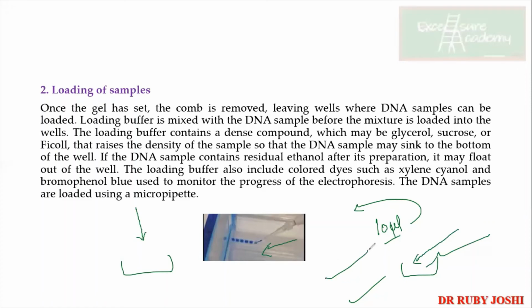So we get so used to it that literally we don't see whether it is straight or slant. We just pour it because we have so much practice. We know that this much distance one well is present, so we just simply load it. Anyways, that will come with the practice only.